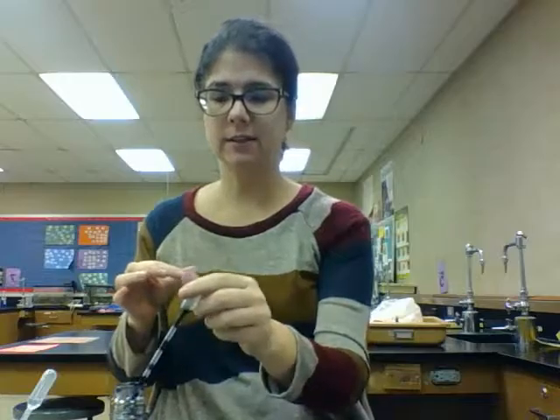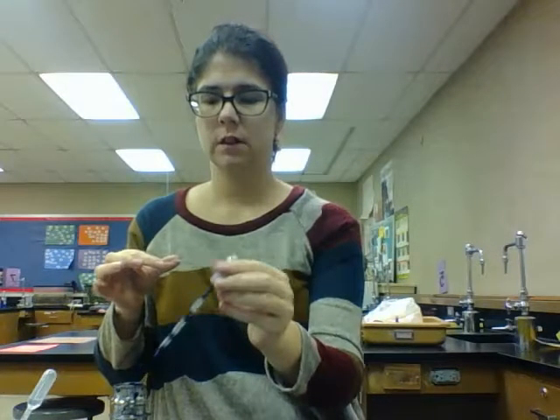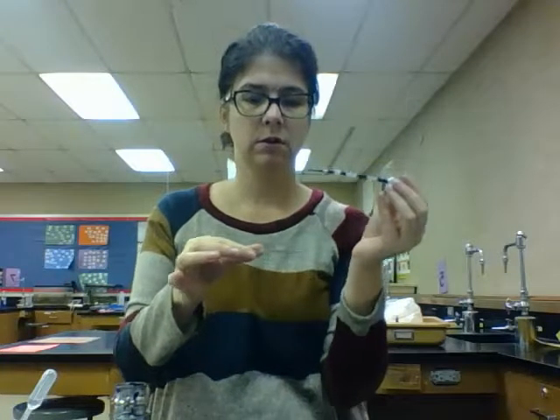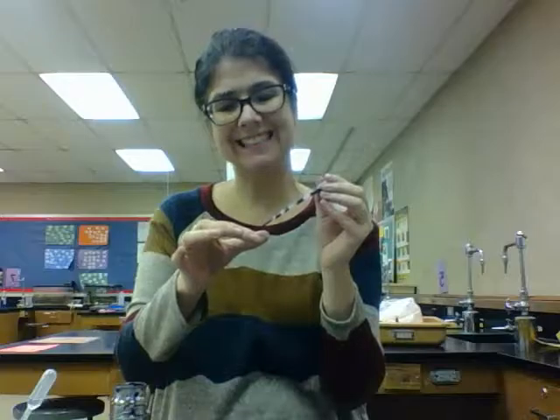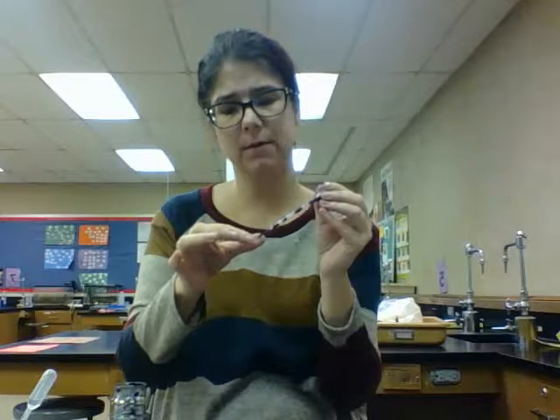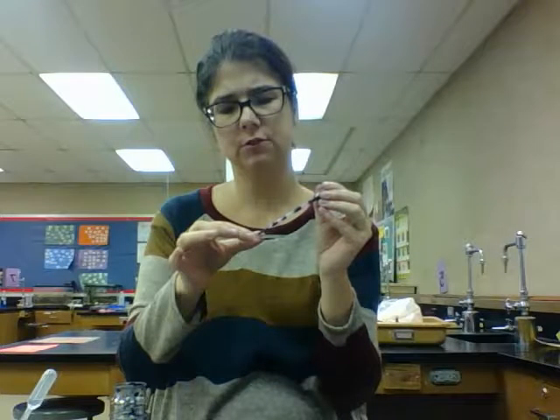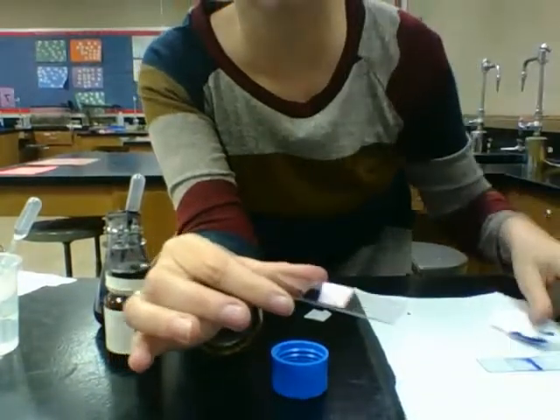To stain it, you'll take a droplet. If it's the iodine bottle, you can just use the bottle itself. If it's the methylene blue, you're going to use the dropper. And you're going to put it on the side of the cover slip, where the cover slip and microscope slide meet up. You'll just put a droplet there. And what's going to happen is you'll see it start to go across the slide a little bit.